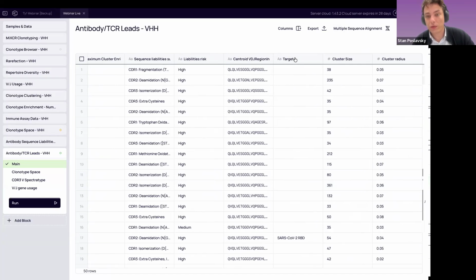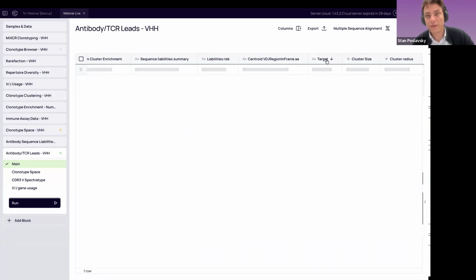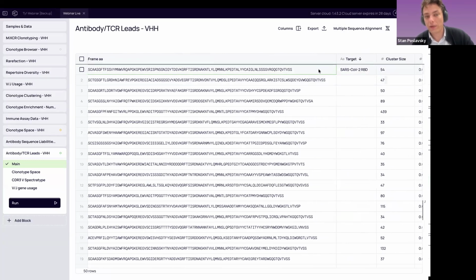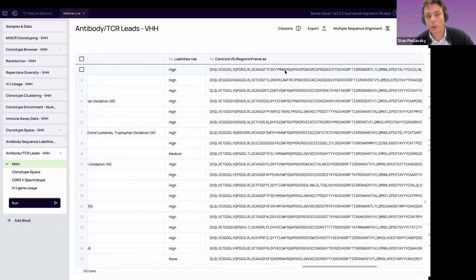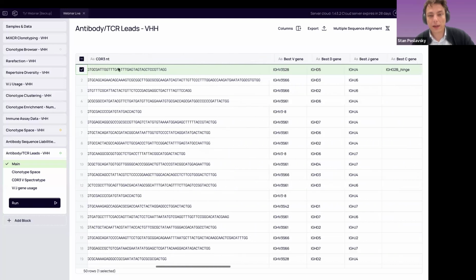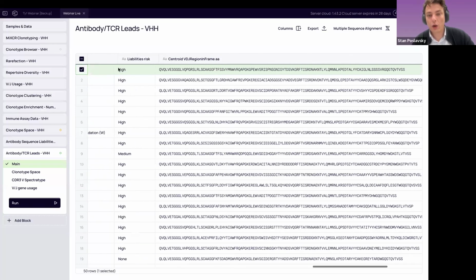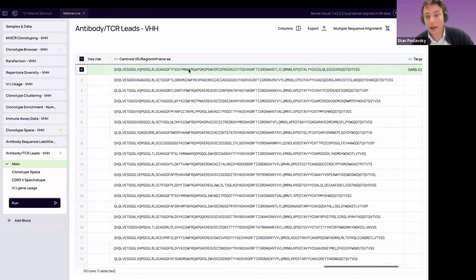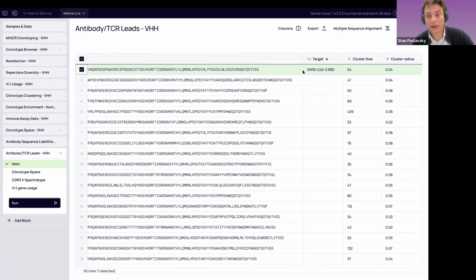How can we do this? We integrated our target from assay data, and bingo, we have it. So you see this one. This one is the antibody which is exactly the TY1, and it is confirmed by our functional data.